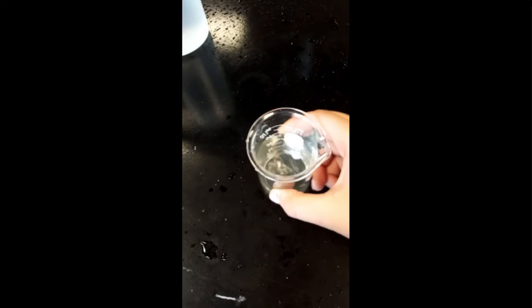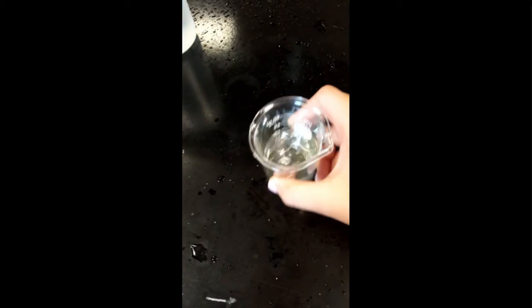And then stir. And remember, your goal is to find the perfectly saturated solution.